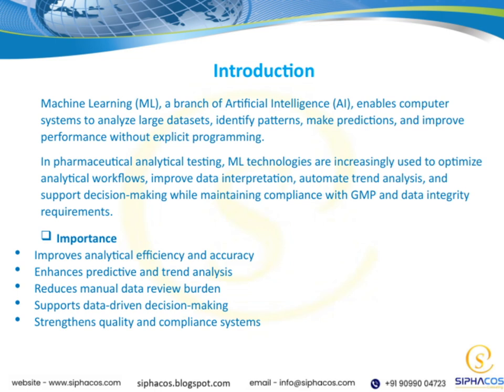In the context of pharmaceutical analytical testing, ML is becoming more and more valuable. It helps us streamline workflows, interpret data more effectively, automate the analysis of trends over time, and ultimately support better decision-making. Importantly, it does all of this while ensuring we stay compliant with good manufacturing practices, or GMP, and maintain data integrity.